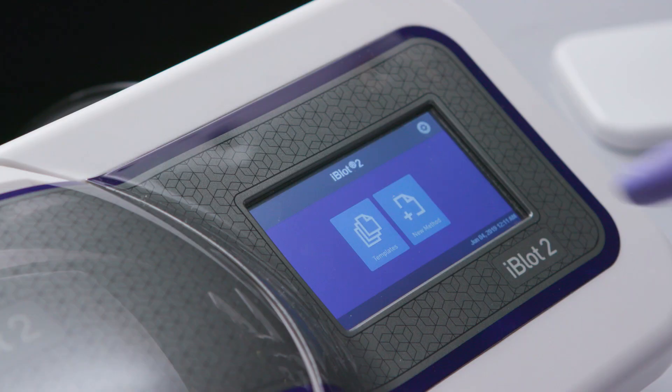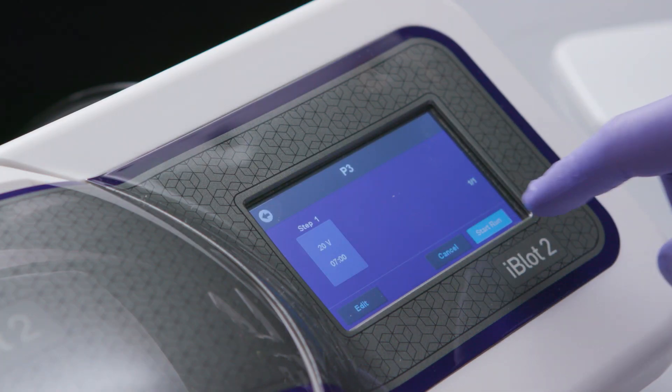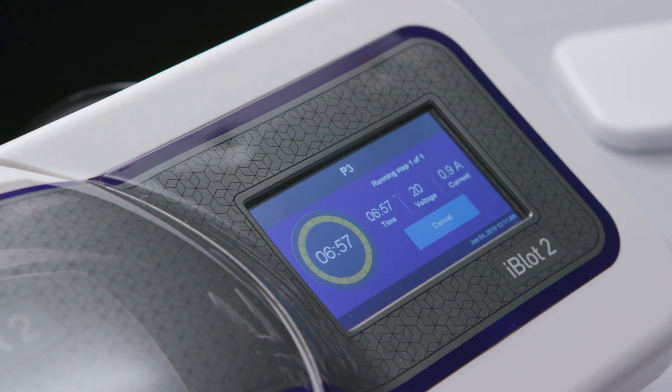You have the ability to create custom methods of your own or choose our recommended preset templates. Select the desired method and make sure the parameters are correct. Touch start to run or use the start last run icon.